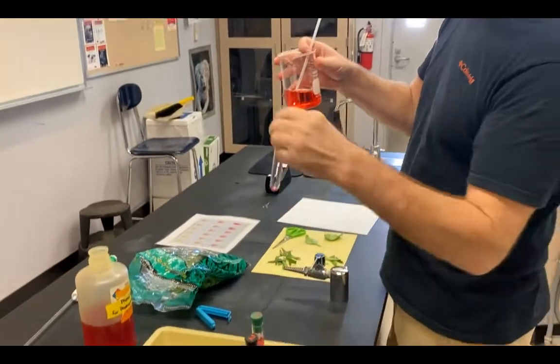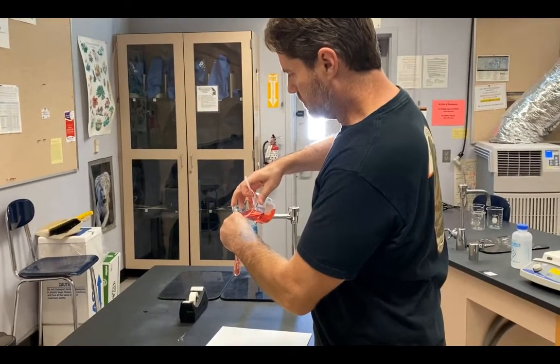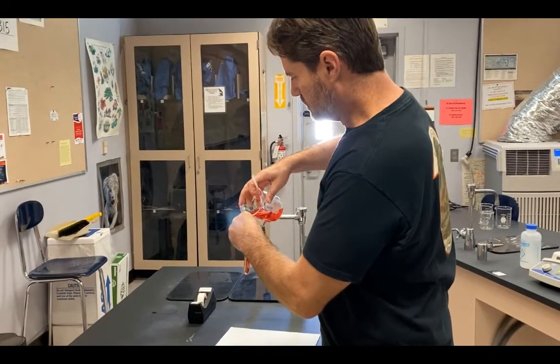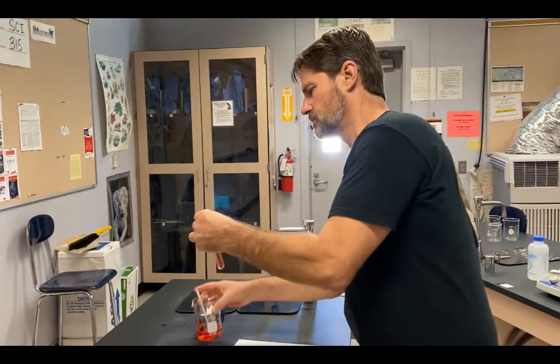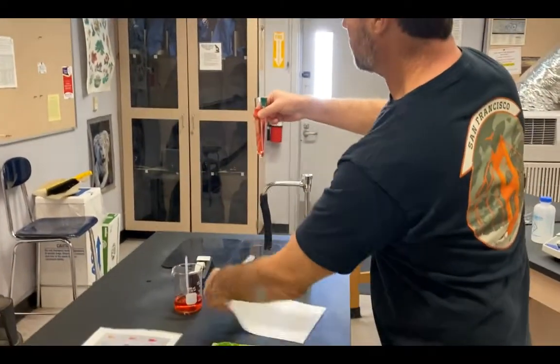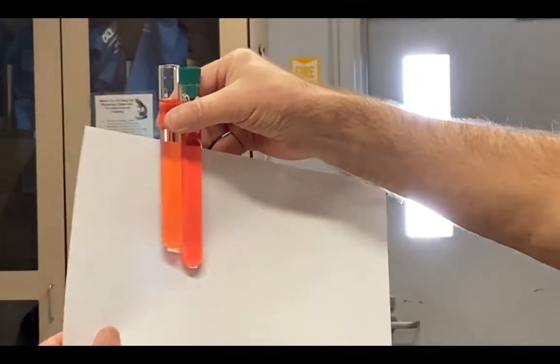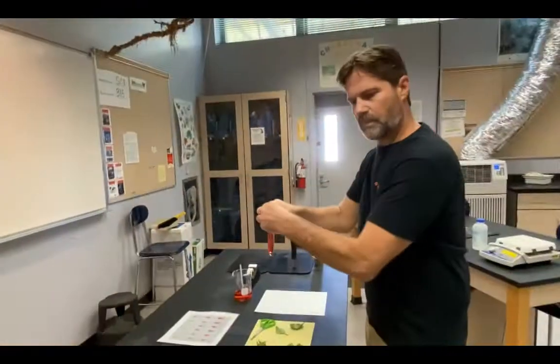Okay, so I'm going to check one more time. Key thing is I need to be able to tell the difference between these two tubes, and it looks like I can do that quite well, so I think I'm ready to go.